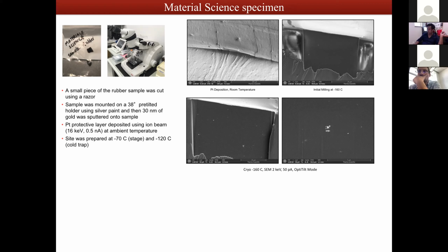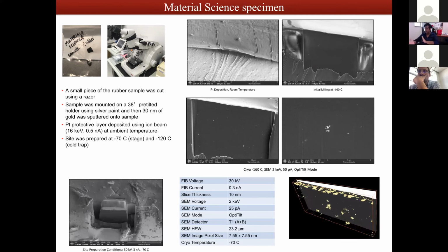Once it starts collecting data, you see in the bottom 2 images there are tiny spots of white densities among the whole gray background. Those densities were the region of interest for us. The scale bar is 5 micrometers long, so you can imagine how small one tiny dot can be. All right, so here it is: a little bit of the trench that has been built, the region where the data has been collected, and a few of the parameters that we have used.